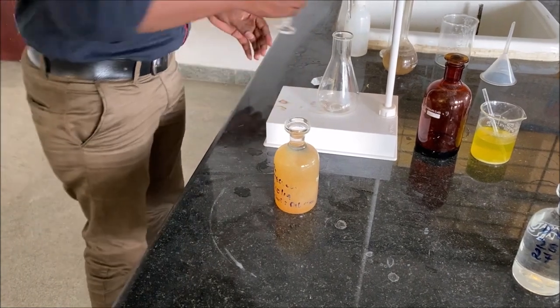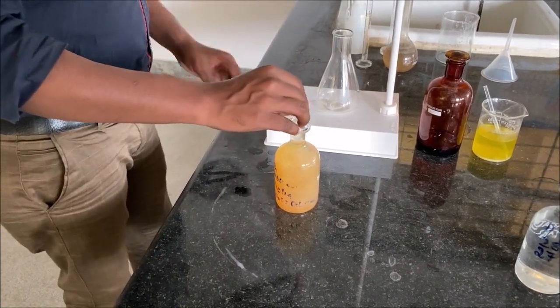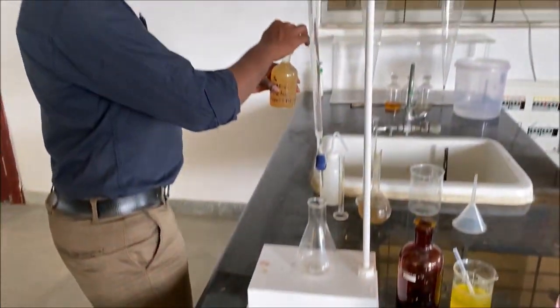Upon adding both of the solutions, the contents of the BOD bottle turn into a precipitate.